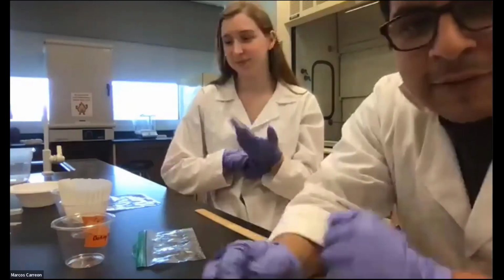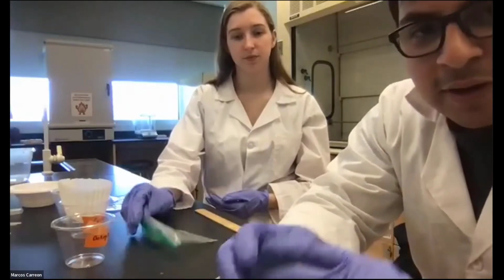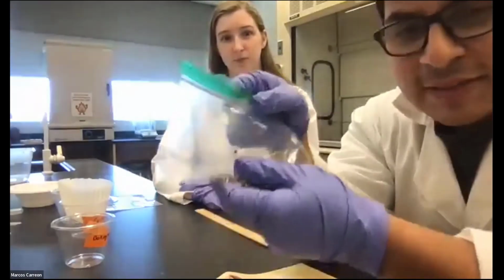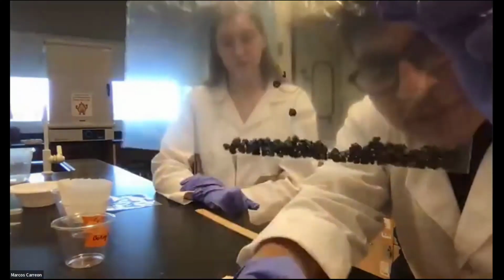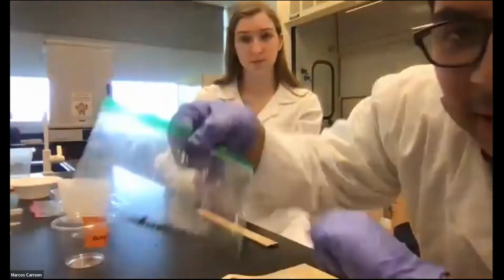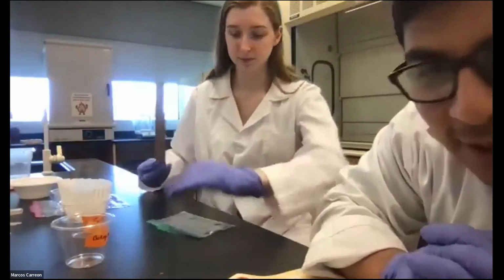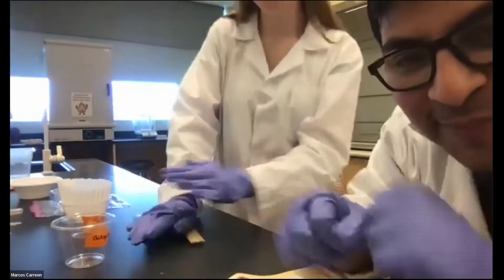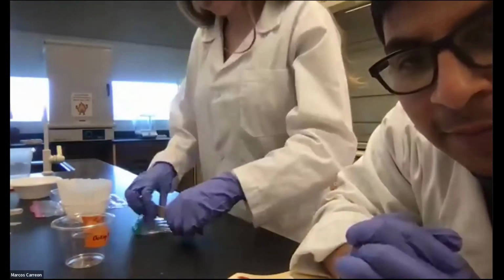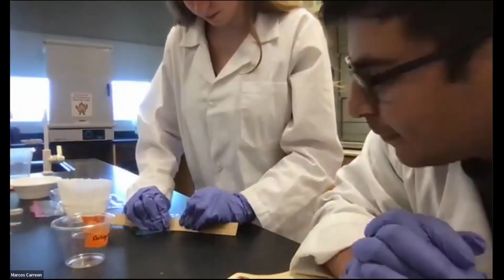All right, everyone, so we're gonna get started. We're gonna start with our bugs. You're gonna go and grab them and place them in this plastic bag like we did already. My partner here, Lynette, is gonna go ahead and crush them now. She's using a ruler. It says a rolling pin, but we're using a ruler. We're trying to get the bugs into a fine powder. So she's doing that now.